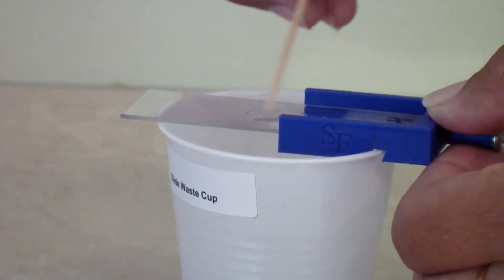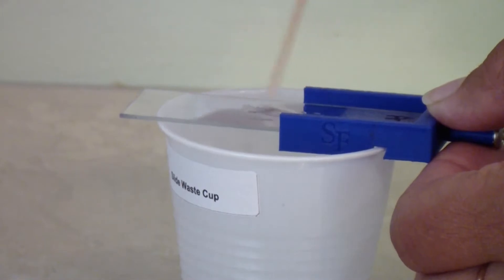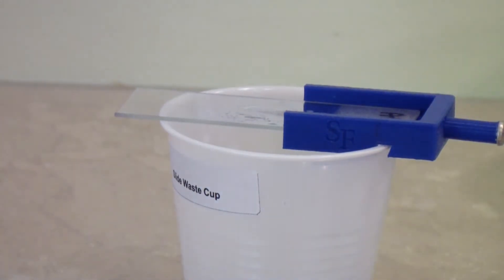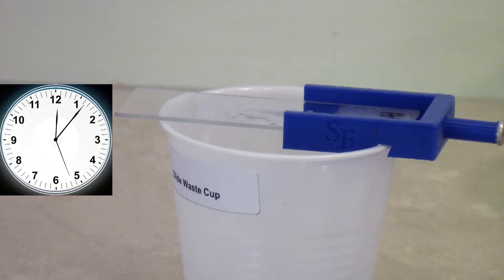Spread the bacterial water drop out so that it takes up about a quarter to half of the slide surface. Let the slide sit on the bench to air dry. Exactly how long this will take depends on how much water you used and the humidity in the air. It may take as little as five minutes or as much as half an hour.